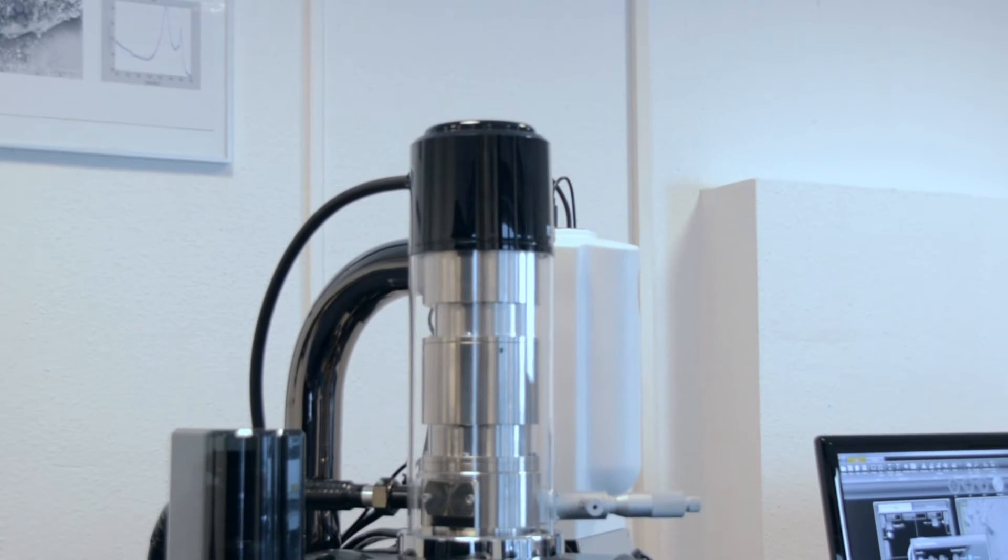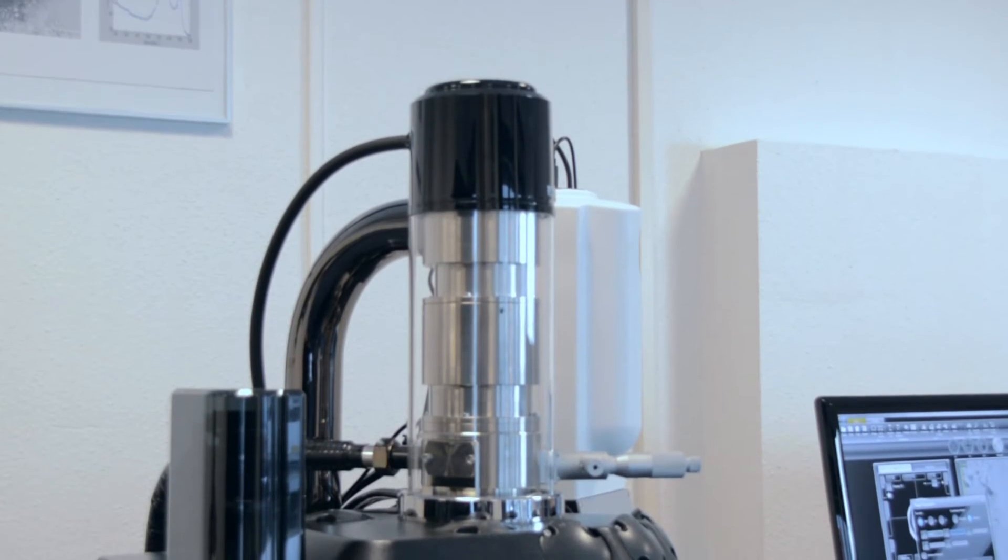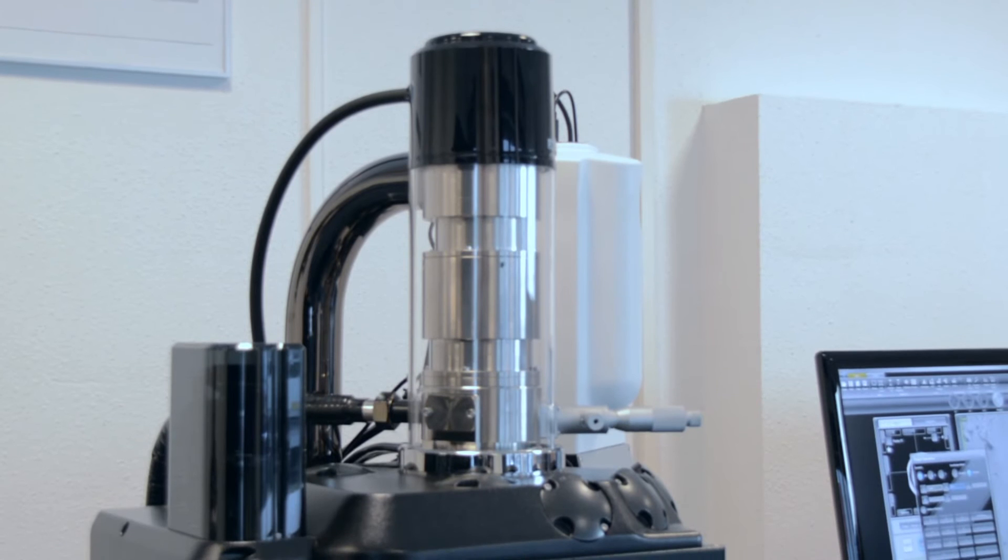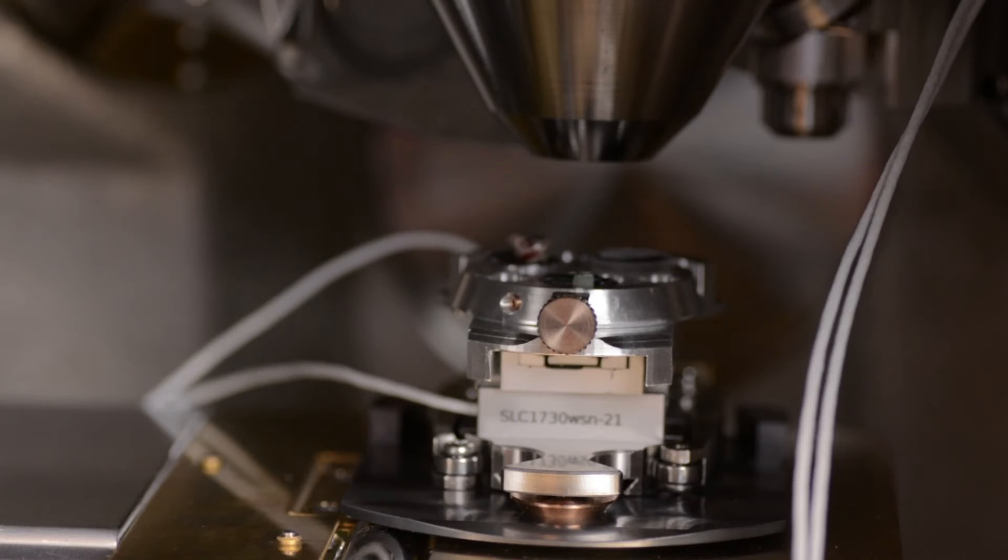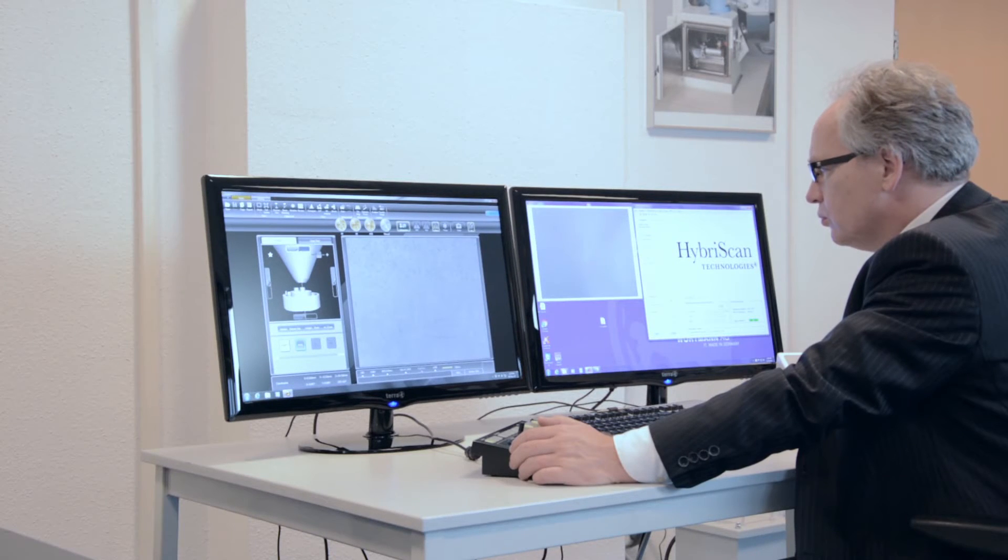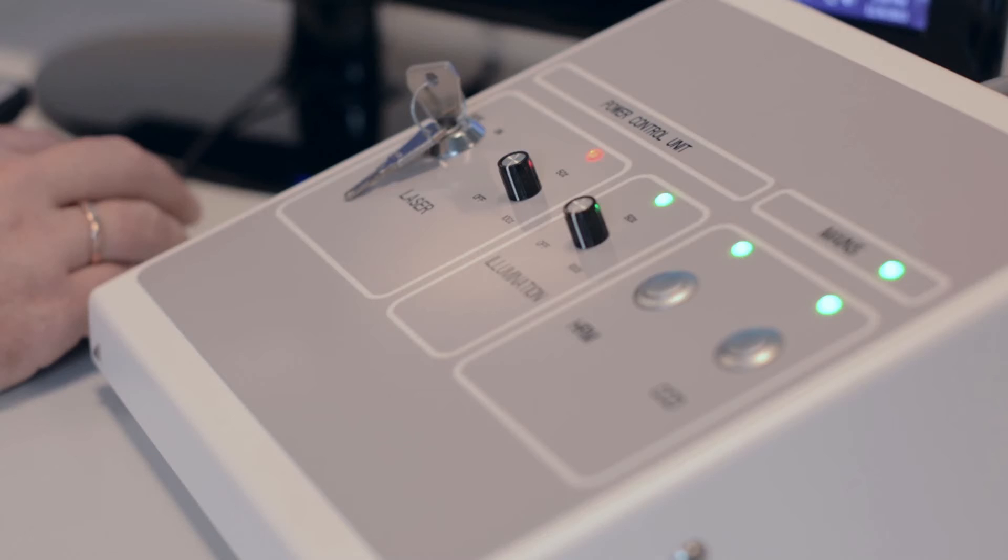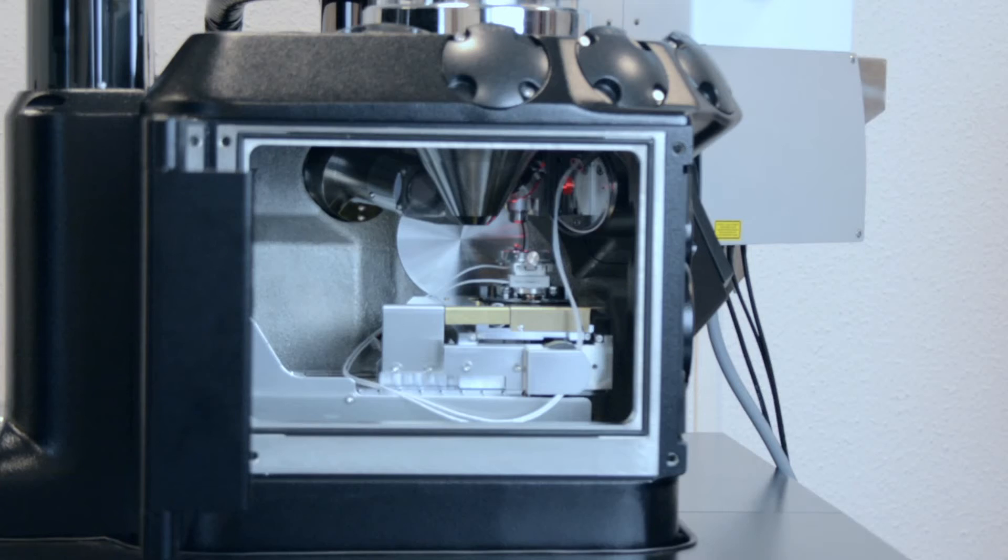The Raman spectrometer is a turnkey system that does not require optical alignment by the user. Raman imaging is enabled with a fast and high-resolution substage. This stage is mounted on the sample holder of the electron microscope main stage. In this way, all functionality of the SEM is preserved.